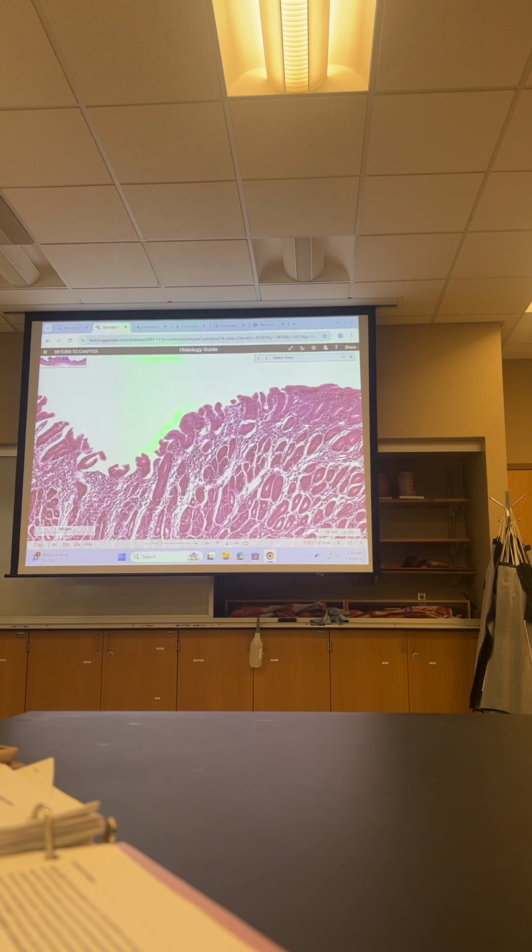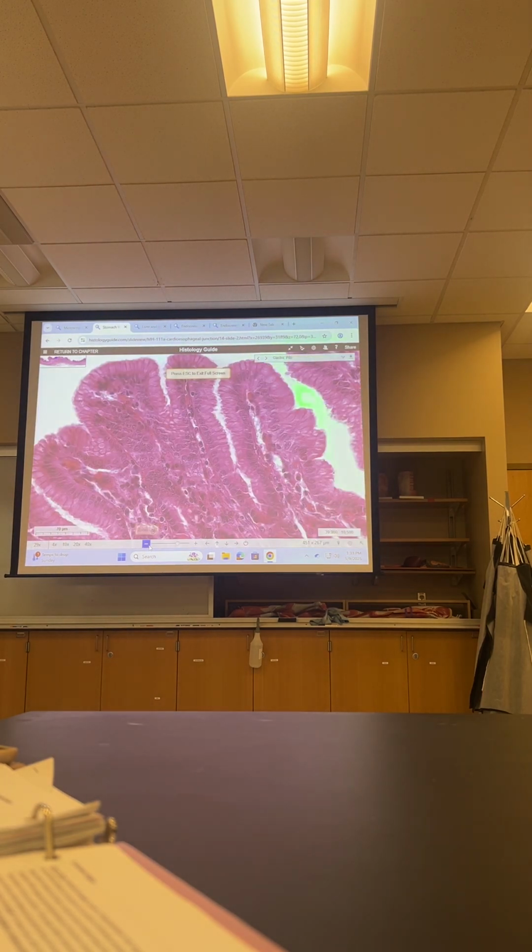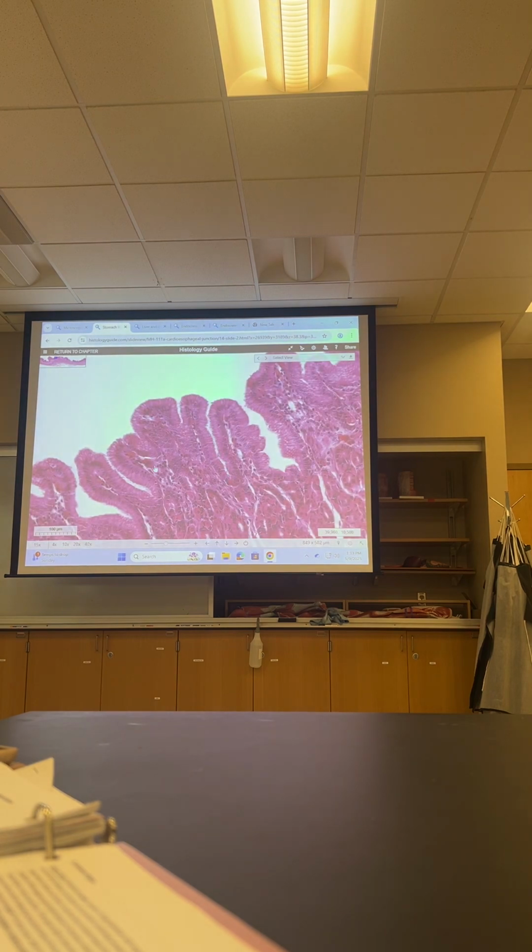All right, so they're just the invaginations into there. Actually, if I click on this, it took me to a really nice one, so let me click on it. There we go. So here, here, and here, those are the gastric pits. And they're just invaginations into the stomach lining.